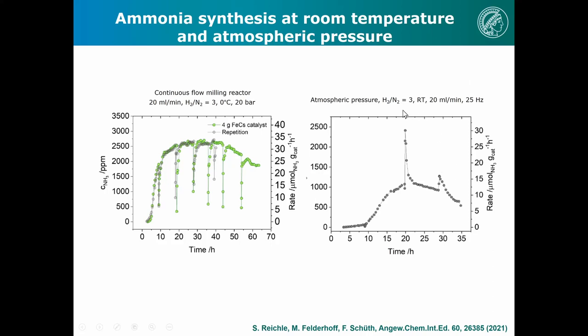Here we did the experiment at room temperature and atmospheric pressure, and even there we still get 0.15% of ammonia while we are milling, only when we are milling, otherwise it's really dead. The reason why this shutdown signal is now positive instead of negative can be explained. It takes a bit longer. It's just a technical reason in how the vessels are constructed.